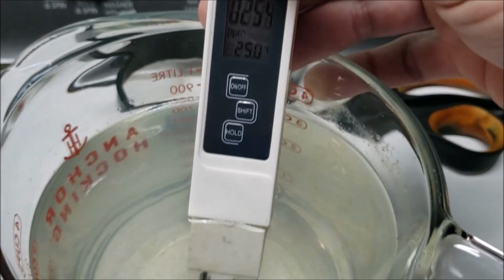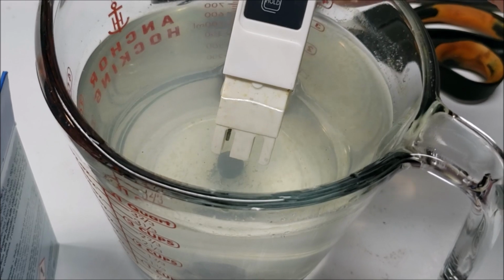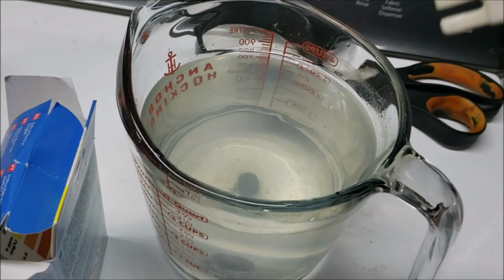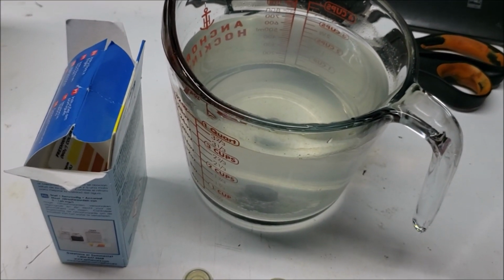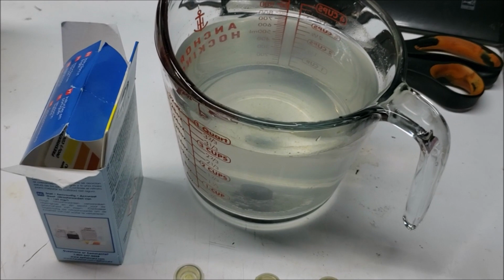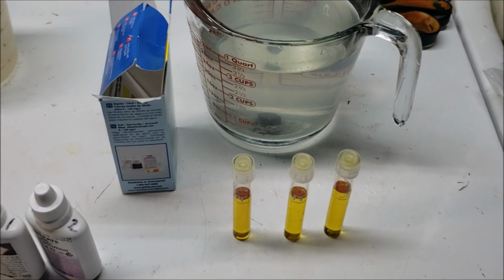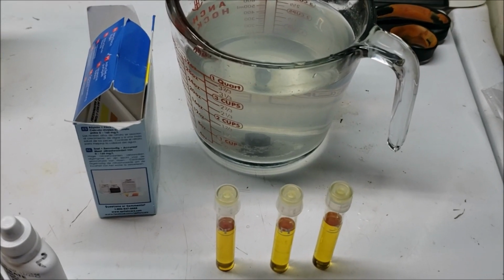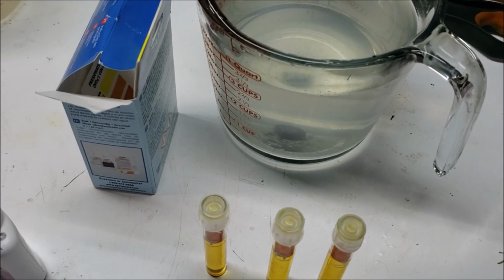So we are definitely dissolving nutrients and minerals into the water, but nitrate is definitely not one of them. If after all this time and with that much dissolved solids being added to that tiny little amount of water, with no plants in there to draw the nutrients out or anything, we're still not getting any trace of nitrate, then that thoroughly concludes to me that these are not ever going to affect the nitrate level in my aquarium. And that's all I wanted to know.